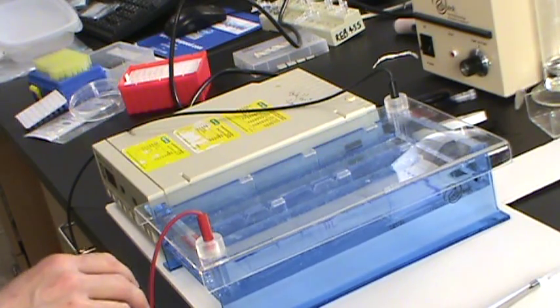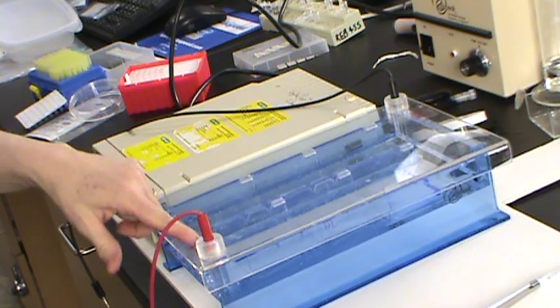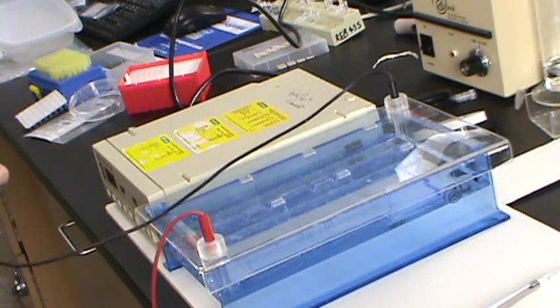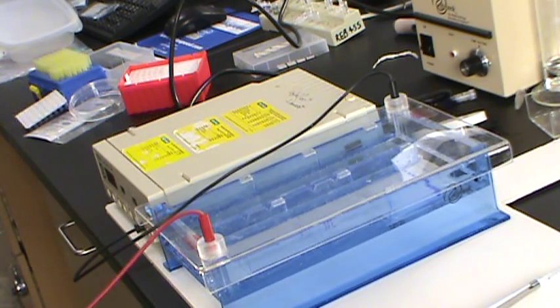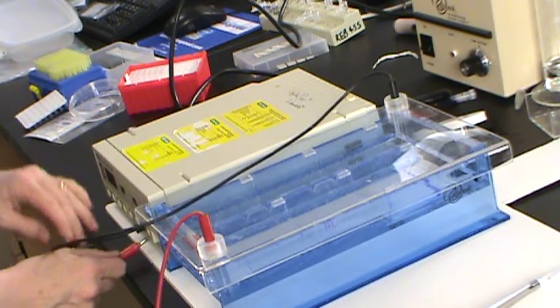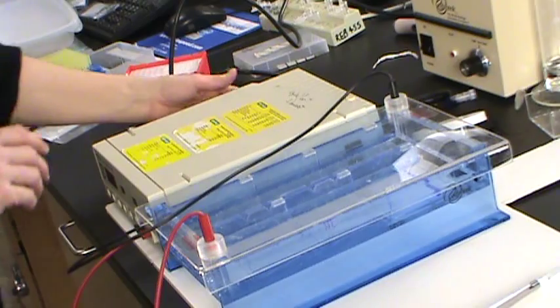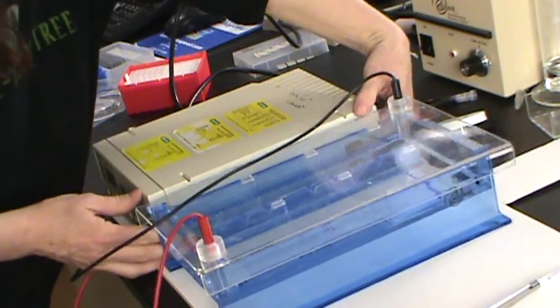So we want to set them in this unit so that they are migrating toward the positive pole. And then we have a power unit here, and again, we want to make sure this is hooked up so we have black to black and red to red. And then turn on our power source here.